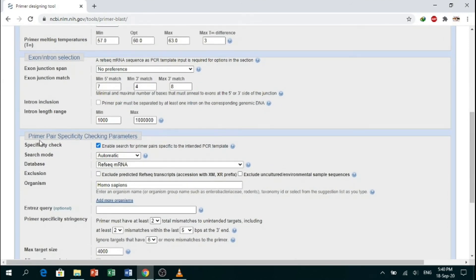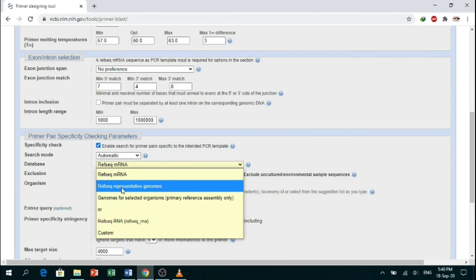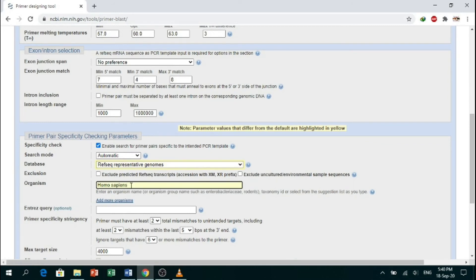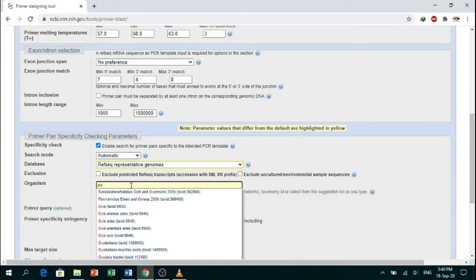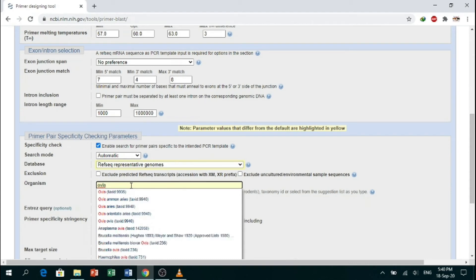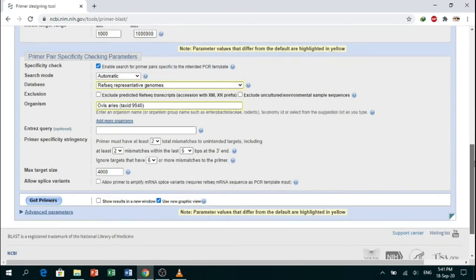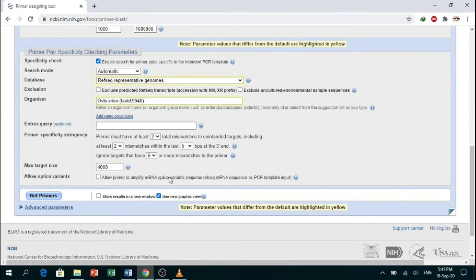Now go down to 'Primer Pair Specificity Checking Parameters'. For database, select RefSeq representative genomes. For organism, as we are using sheep, we will search for Ovis aries and select it. Here is Ovis aries. Click on 'Get Primers'.